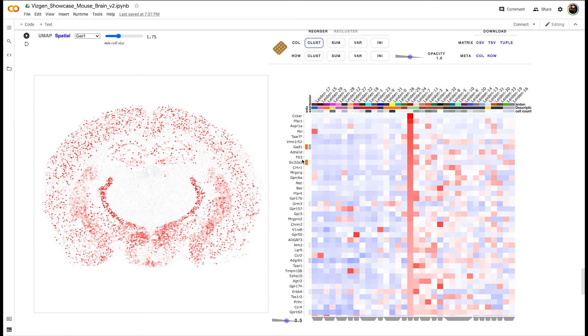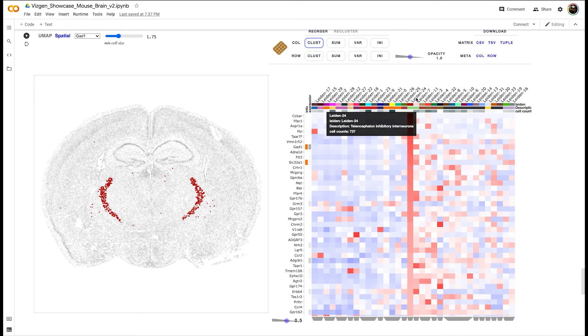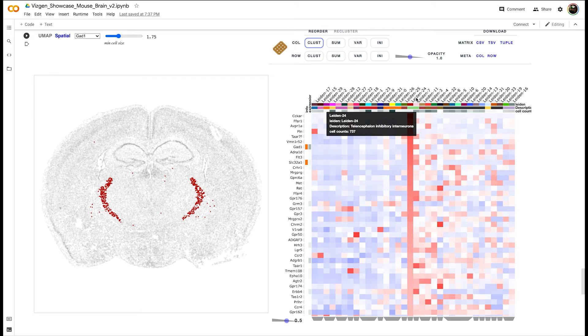We see GAD1 and SLC32A1, which are involved in GABA production and packaging respectively. We can see that they're also highly expressed within the region of this cluster 24, so this agrees with our expectations for what this cell type would be expressing.